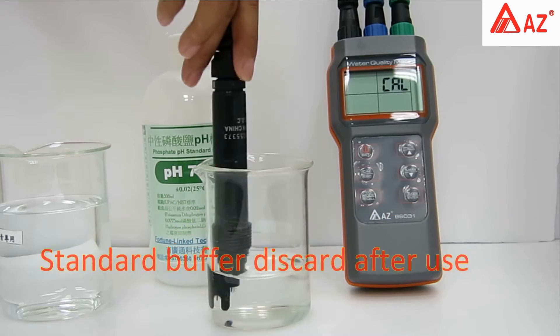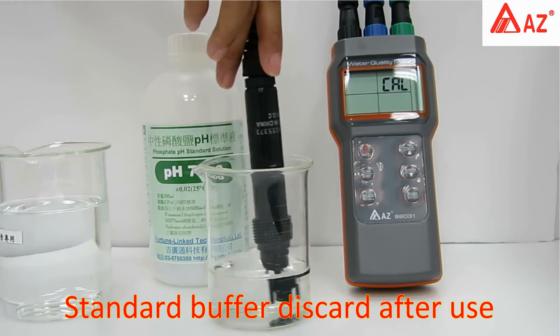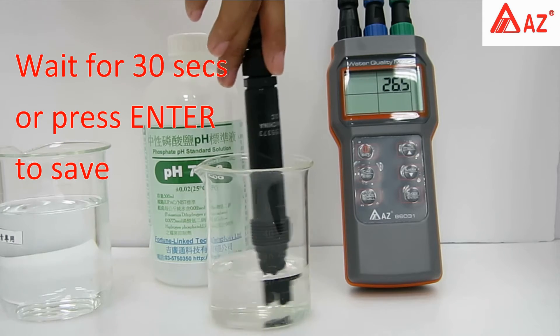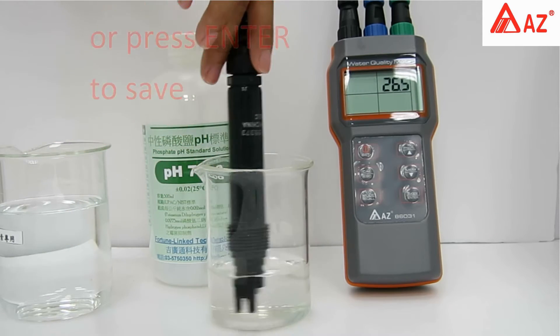Do not reuse standard buffer. Once the reading stabilizes, press Enter or wait for the SA icon to appear — the result is automatically saved.